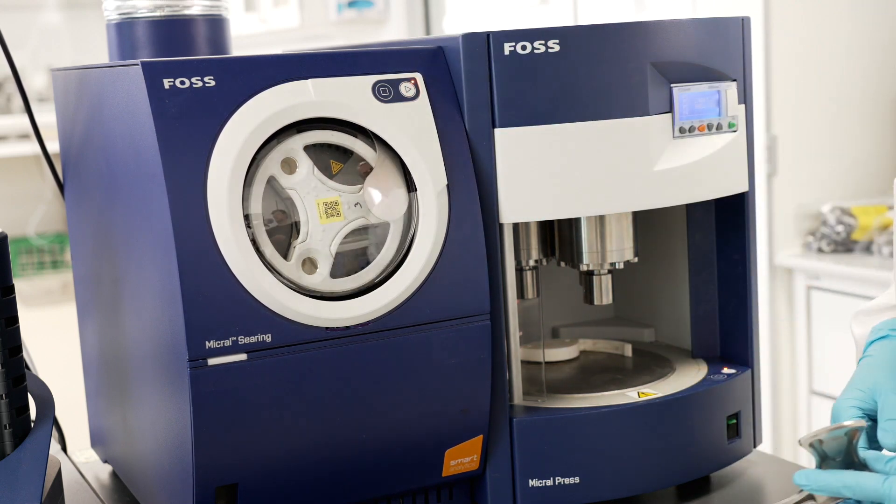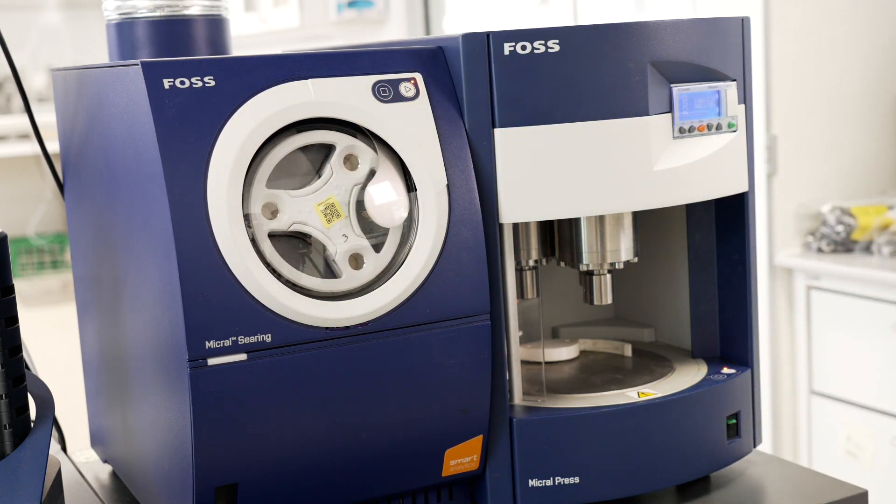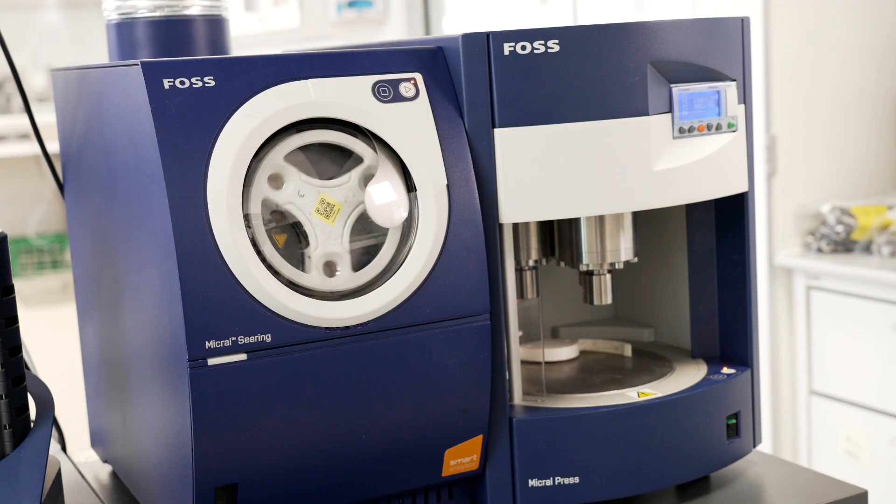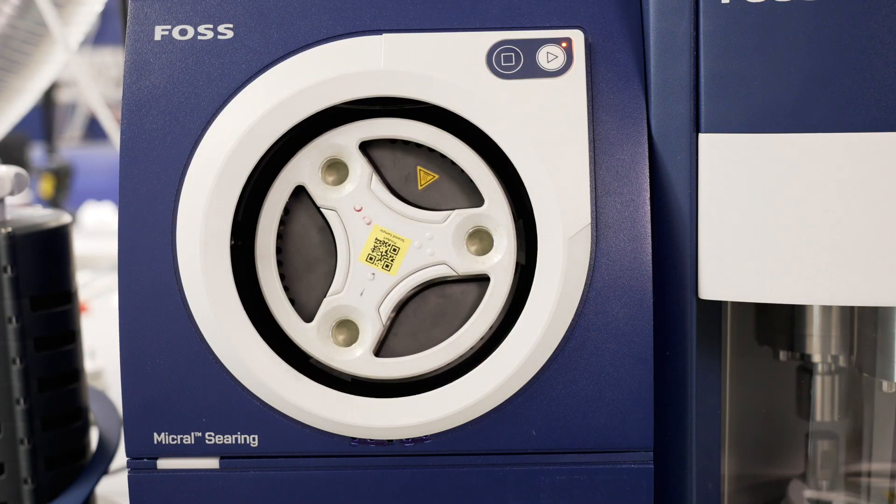After pelletizing, the sample surface is seared in the micro searing unit. This improves the level of quantification and reduces the sample matrix effect.